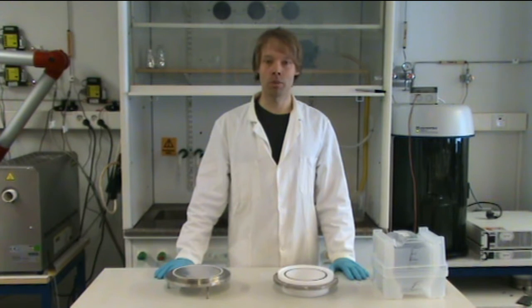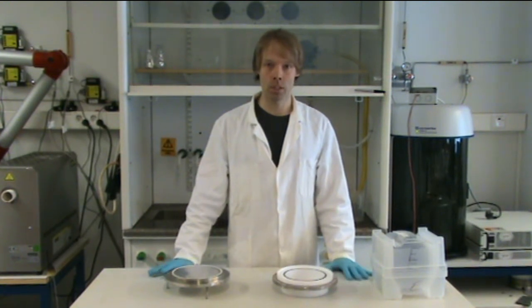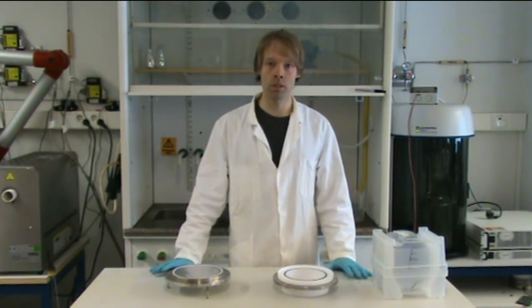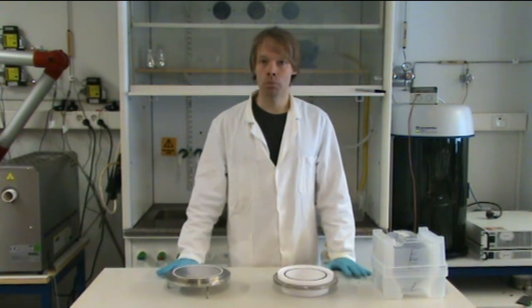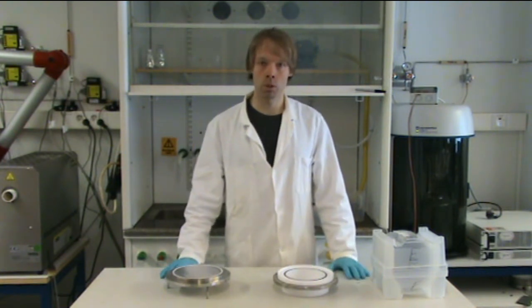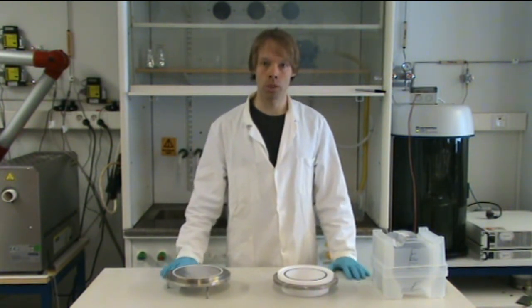Hello, I'm Joachim Grieconen from the Department of Applied Physics from University of Eastern Finland. In the following film we are going to introduce you the production of mesoporous silicon.